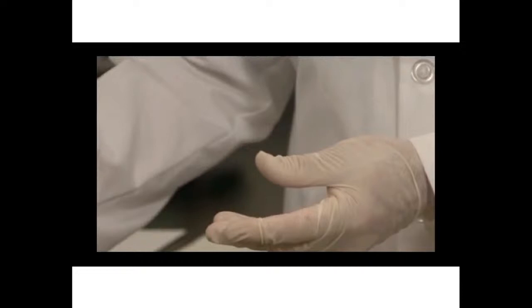The steps following rehydration and focusing of the IPG strip are equilibration of the IPG strip in preparation for the second dimension gel, which I will now demonstrate. The equilibration process is a two-step procedure. Equilibration buffer number 1 contains DTT for reduction of proteins in the strip. Equilibration buffer number 2 contains iodoacetamide for alkylation of proteins in the strip. Each solution contains SDS for denaturation of proteins in the IPG strip to ensure optimal performance in the second dimension.